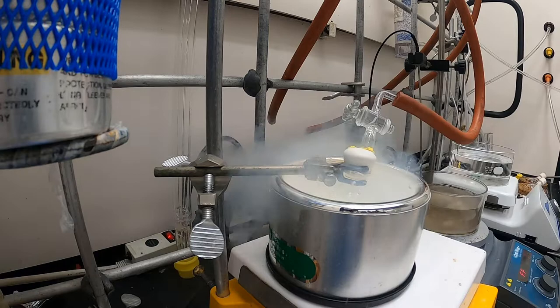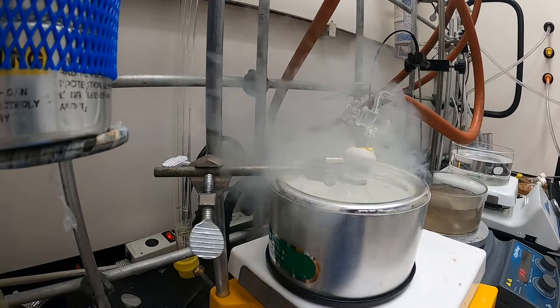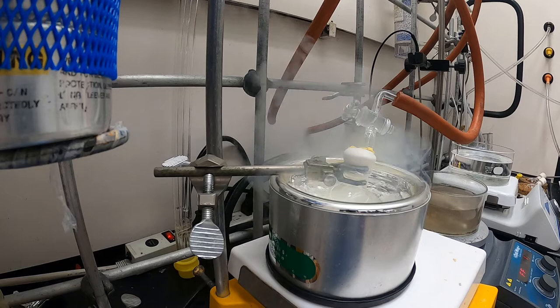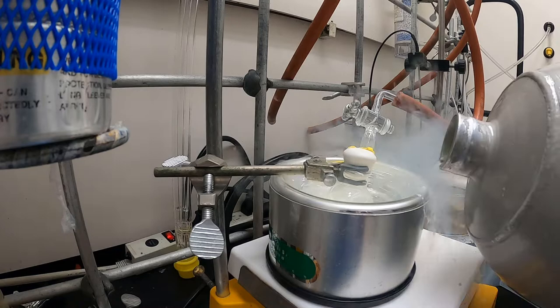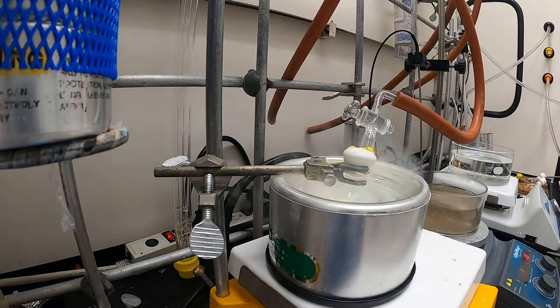So the next step in this process is to perform a few cycles of freeze-pump-thaw to remove any dissolved oxygen in the reaction mixture. And to do this, I've clamped my flask and am freezing it in liquid nitrogen. Once the reaction mixture is sufficiently frozen, I will open the stopcock to my vacuum line to remove any air from the headspace.